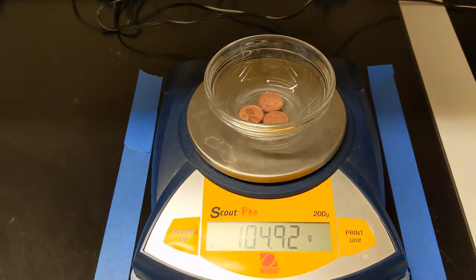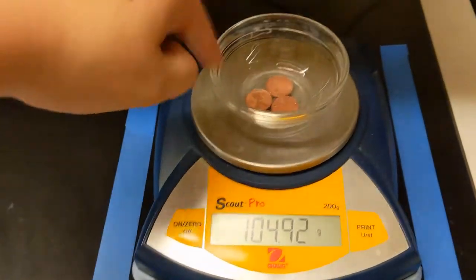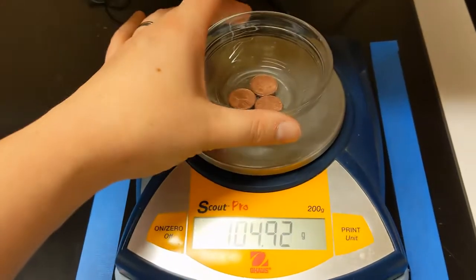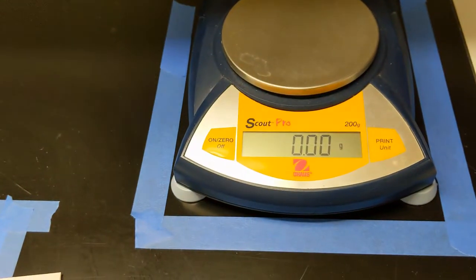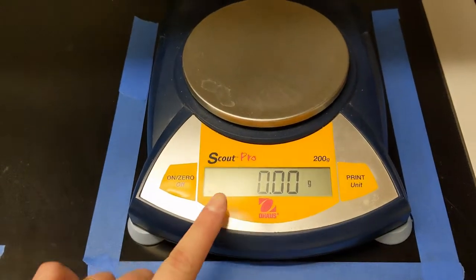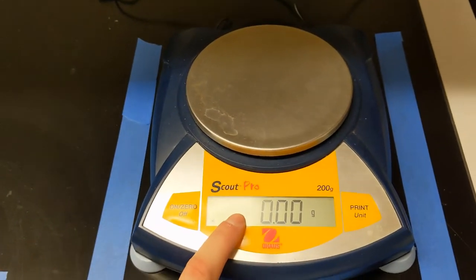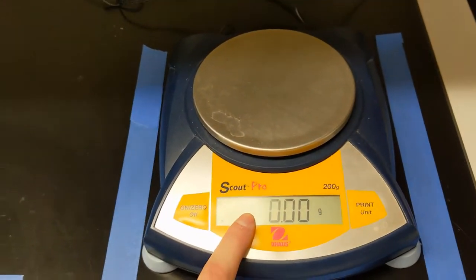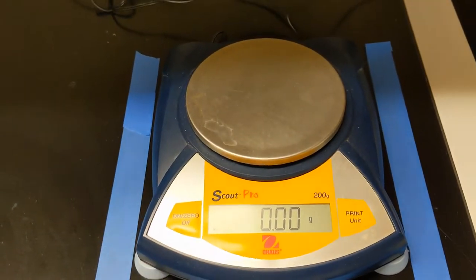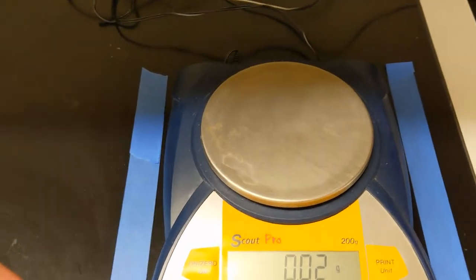However, I want to measure the mass of each individual penny, not all of them together, and definitely not in this heavy glass bowl. So, in order to take a reading of just one object, one penny, first we want to make sure that our balance is zeroed. So this is already zeroed, and yes, that is the technical term we use. So this means to start it out fresh so that we are only measuring our object of interest. Let's measure penny number 1.